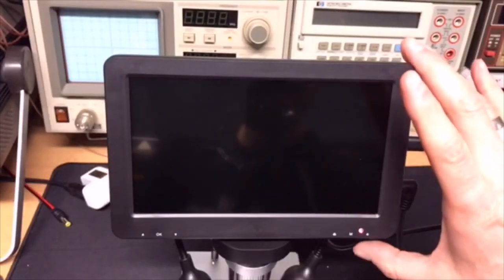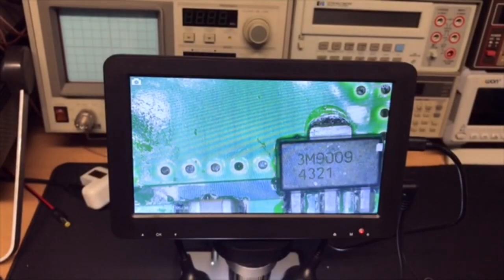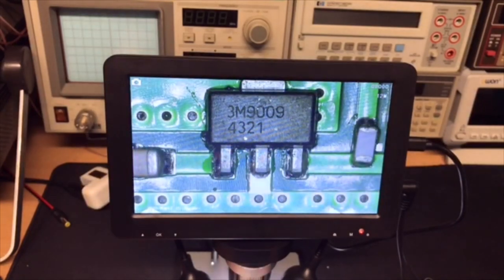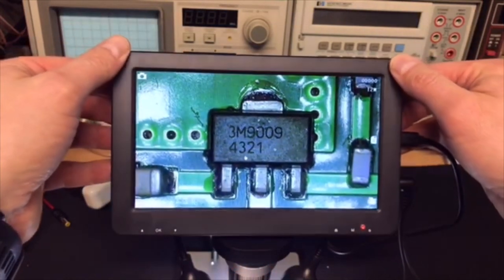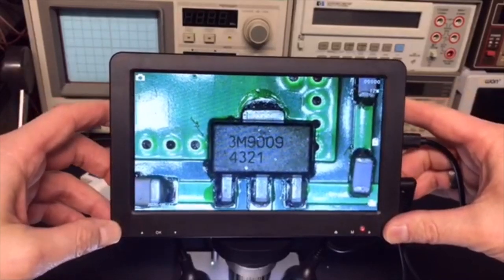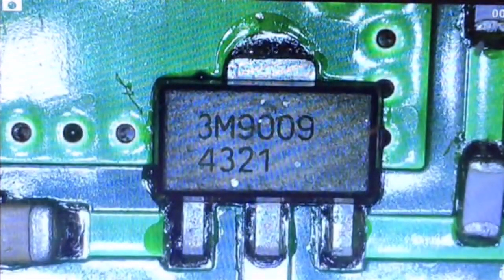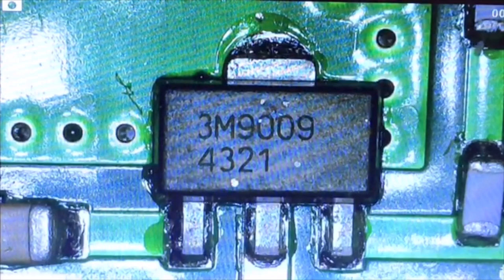Okay, we're now looking at the microscope. Let's switch it on. Well, it knows it's not connected to the computer, so probably will not ask any questions. No, it doesn't. Yeah, and if you look now, this is really useful because this is just from the little display of the microscope itself, and you can even tilt the display a little bit. So if I zoom in now, you can see this is so much better than from the computer screen. And probably if you make a picture of 12 megapixels, the display cannot even show that, so it will be even better from the picture.